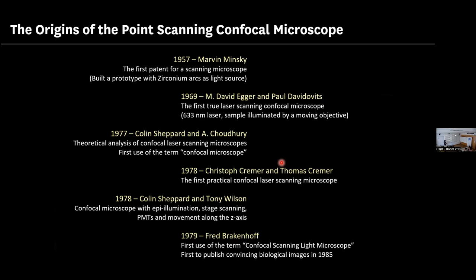So the confocal microscope, it's not the invention that we use today. It's not the invention of a single man. It has the contribution of many people in a similar period of time in different places and countries that were exploring the same idea. So Fred Brakenhoff used this confocal microscope in 1985.